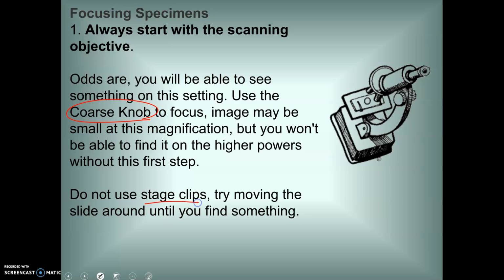They suggest not putting your specimen under the stage clips right away because you may need to move your slide around. And then when you get it where you think you're seeing something, then you can put it under those stage clips and that'll hold it in place.